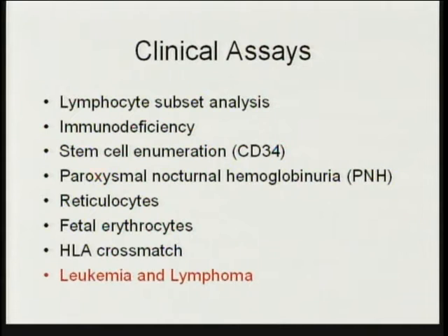And one can measure reticulocytes, fetal erythrocytes, do HLA cross-matching, and there's an ever-expanding list of these types of applications that are suitable for the clinical lab. The one we're going to spend more time talking about today is one of the most difficult applications, but also one whose use is increasing most rapidly, which is the evaluation for leukemia and lymphoma.